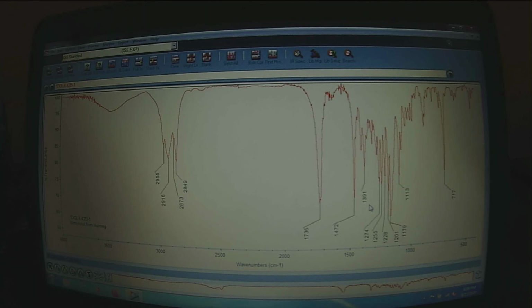The bigger the dipole moment for the bond, the more intense the peak is, because one of the rules for IR absorption is that it has to change the dipole of the molecule as well as having energy. So we've got our carbon-oxygen single and double bond stretches.